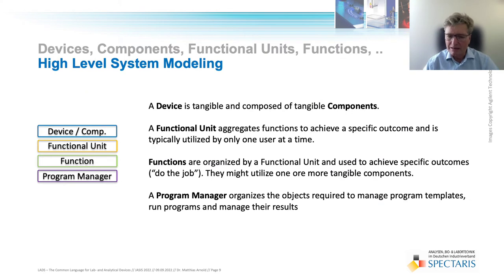In the next slides, I will give you a brief introduction to some of LADS' high-level information modeling patterns. First, the hardware view. Required for all the use cases around asset management, including serviceability. The hardware view models devices and their components. Devices and components typically have properties like nameplates, date of installation, condition monitoring, status of calibration, validation, and so on.